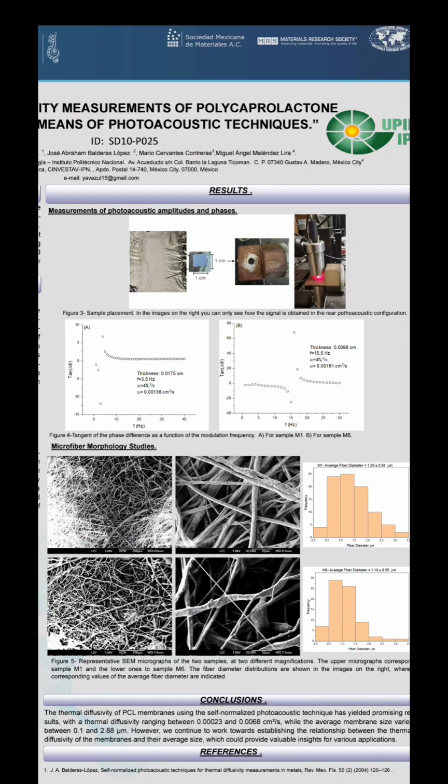In conclusion, we can state that the thermal diffusivity of polycaprolactone membranes using the self-normalized photoacoustic technique has yielded promising results. However, we continue to work towards establishing the relationship between the thermal diffusivity of the membranes and their average size, which could provide valuable insights for various applications.